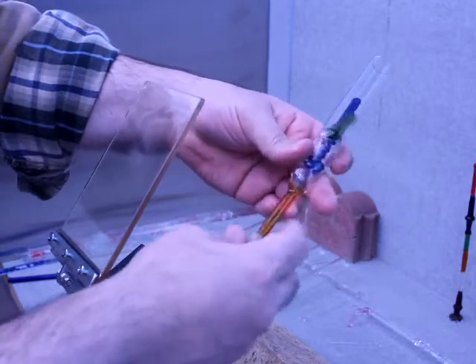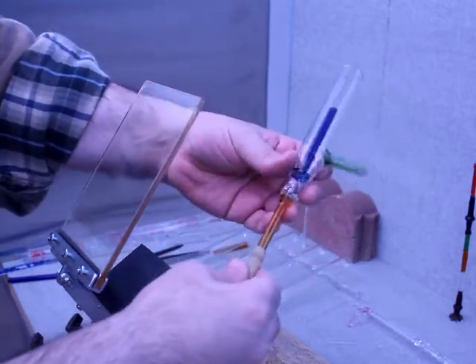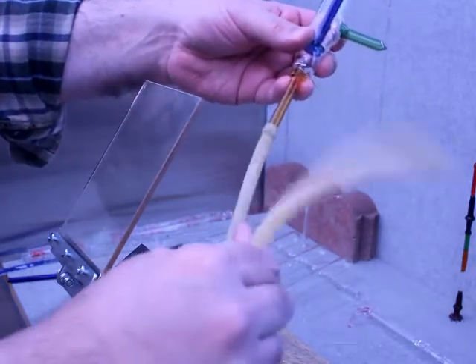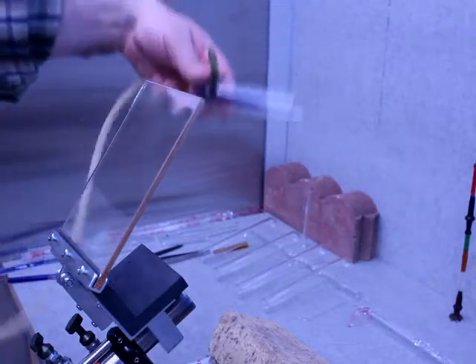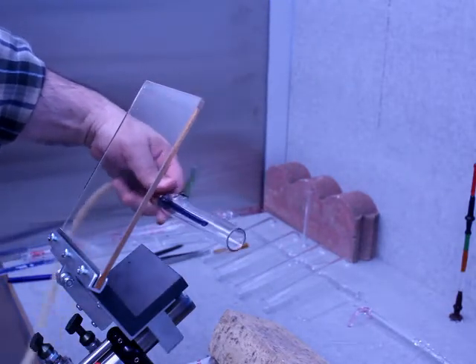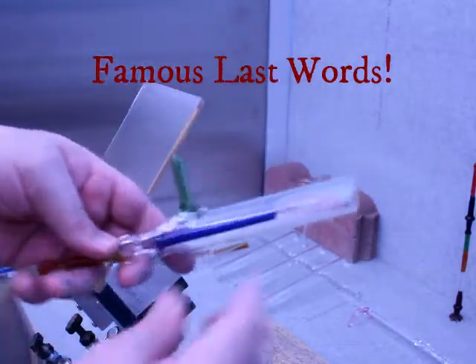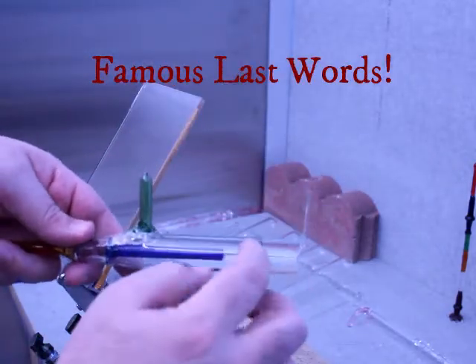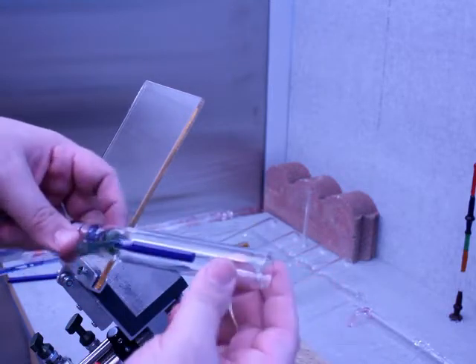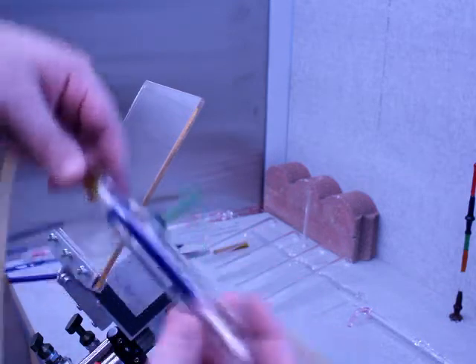I think the smallest size it fits is about 10. So I've basically just taken some hose and connected it. It's going to be a little awkward because without a swivel, it's going to kink up, but it'll be fine. And what I'm doing at this stage is I want to remove the bottom of this tubing and make this basically into a test tube, and that'll be the bottom of the bubbler.